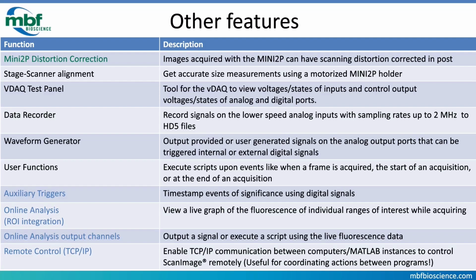You can do this for multiple regions of interest. Also helpful for complex experiments using multiple computers and or multiple MATLAB-based softwares is ScanImage Remote Control, which allows you to control ScanImage from a second MATLAB instance on the same computer or a different computer on the same network.